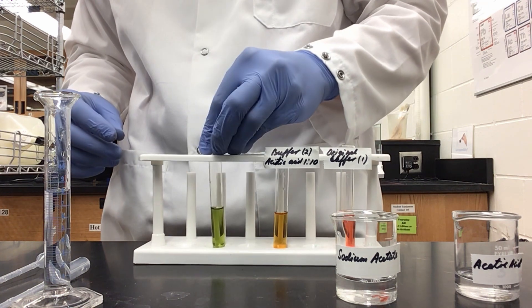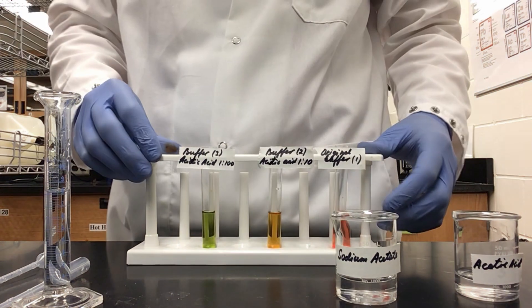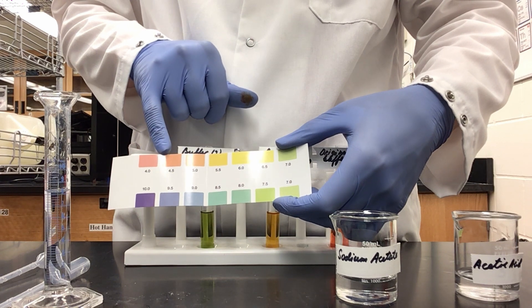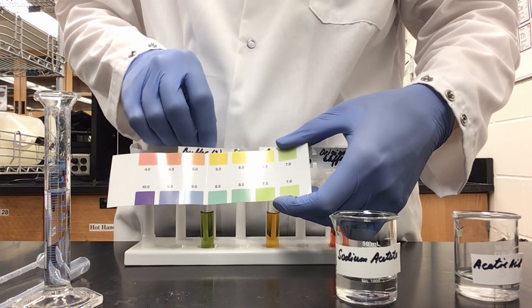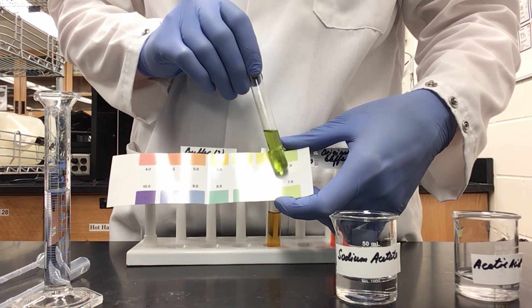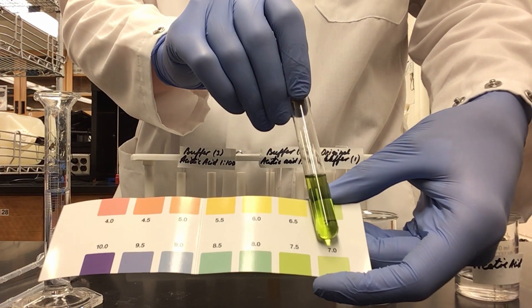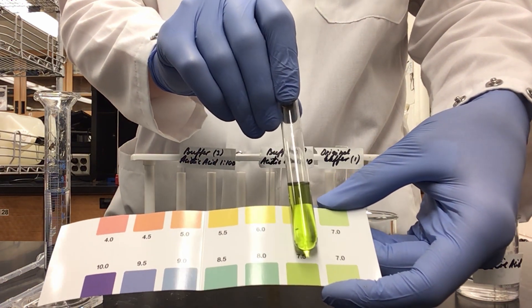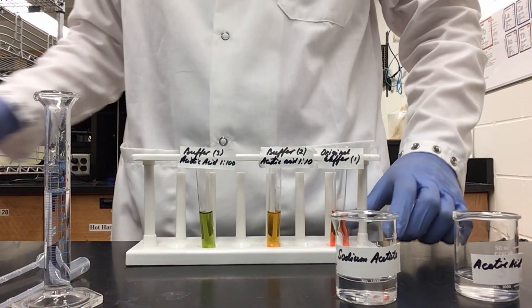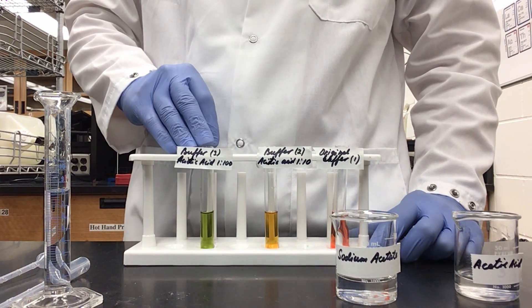As you can see from our new solution, our 1 to 100 dilution of acetic acid has caused this buffer to not stay at pH 4 to 4.5 or 5 to 5.5. We have instead increased up to between 7 and 8 based on our color. Since we have a greenish color, I would put this solution at about a pH of 7.5, which is an extreme step up from what we would expect of just another change of 1 in its pH.